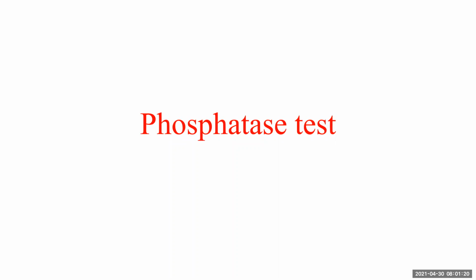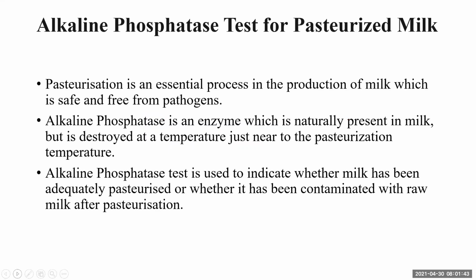Here we are going to discuss today the phosphatase test. Why is the phosphatase test performed? It is performed to check the efficacy of pasteurization, whether the pasteurization process has been done properly or not. For that purpose, the phosphatase test is done. So the phosphatase test is basically a test to check the efficacy of pasteurization.